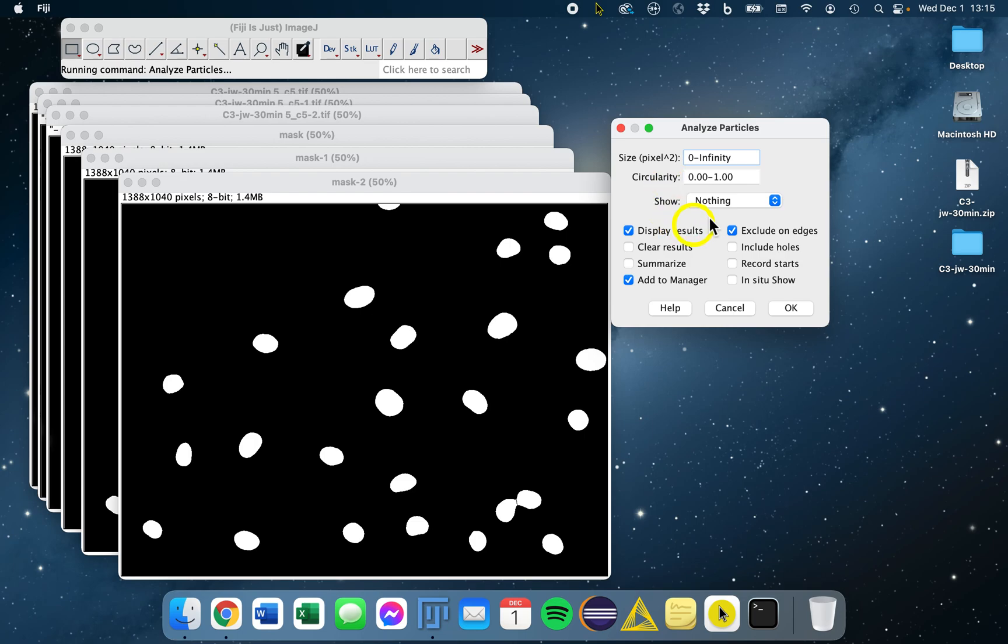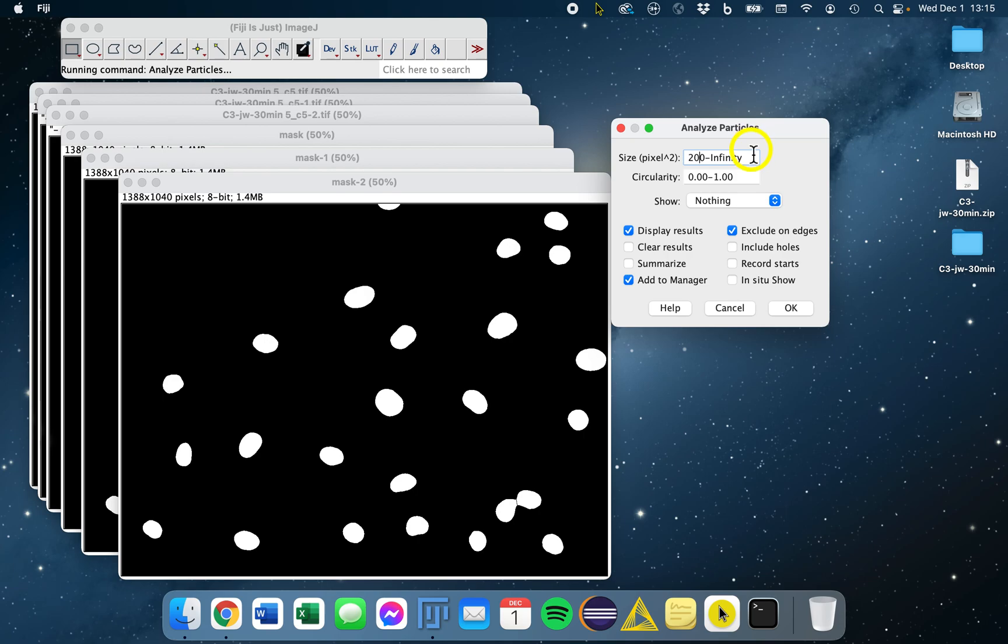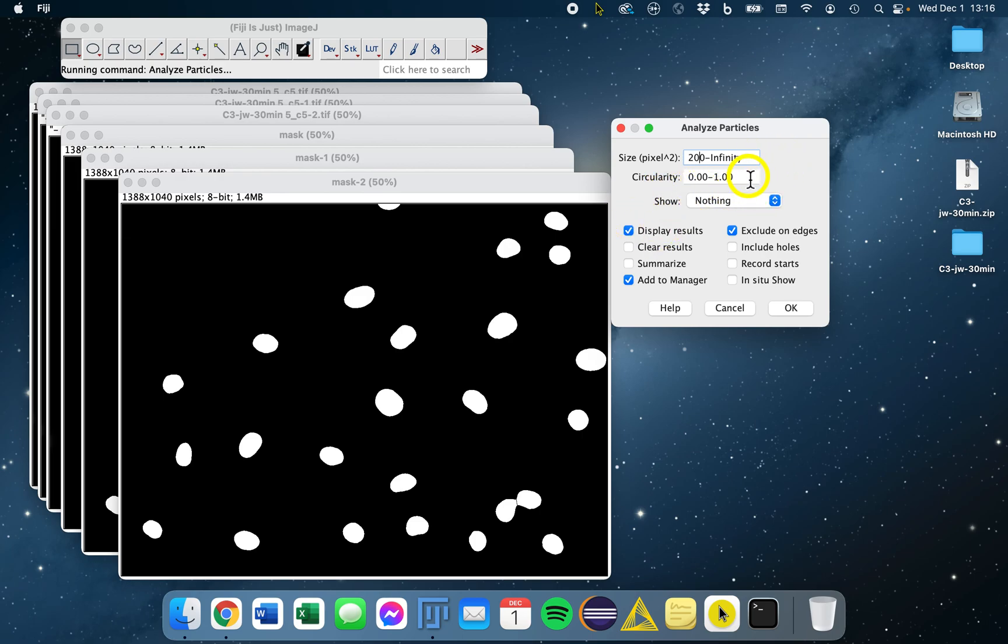You can filter your selection of objects based on different features. The first one is size. We're going to set ours to 200 to infinity. You have to be careful here that size is not one of the measurements you want to use to compare your objects. Then you don't want to filter anything out as it could influence your datasets. Then there's circularity, the closer to one being more circular objects.